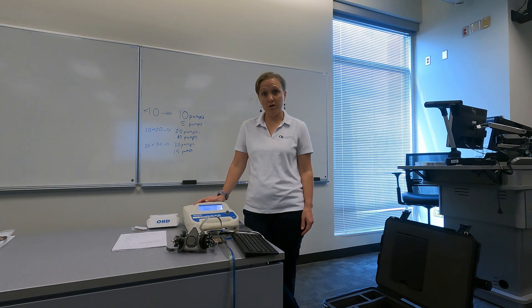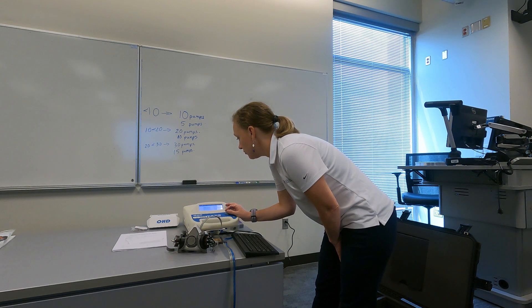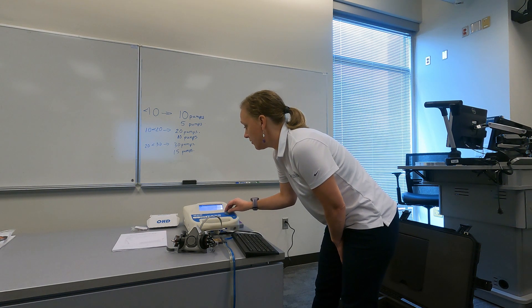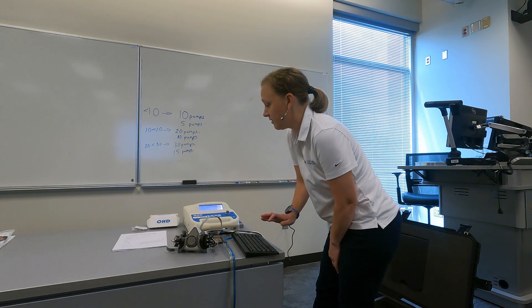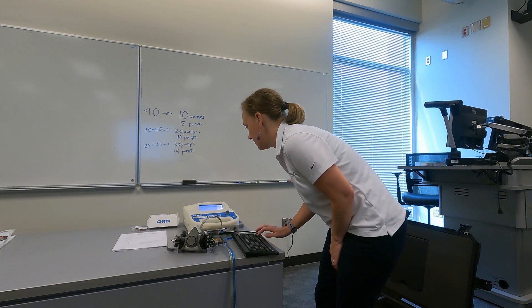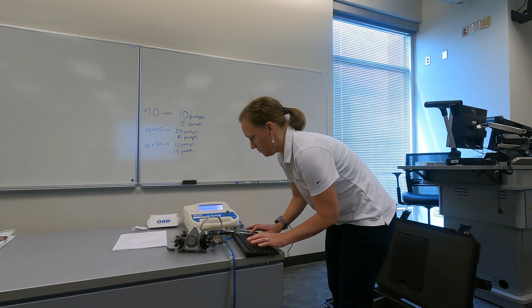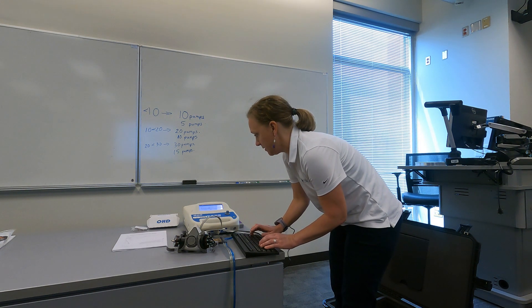I have already turned this machine on and done the calibration check for today. Now I'm going to get ready to do a test and fit test myself. I'm going to select test, and then clear all the subject's data. Then I'm going to enter in the subject information — I'll put in my first, middle, and last name.